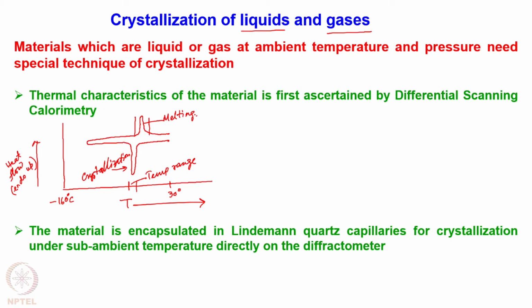From my previous experience, I can share that the liquids that we generally deal with can have 3 different types of DSC patterns. The first type of liquid is shown here, which is very simple, which on cooling from room temperature crystallizes at a temperature just lower than room temperature, can be crystallizing at 0 degree centigrade, can be at -15, -20, maybe -30, -40 degree centigrade.